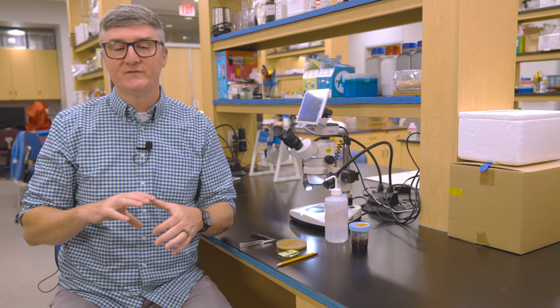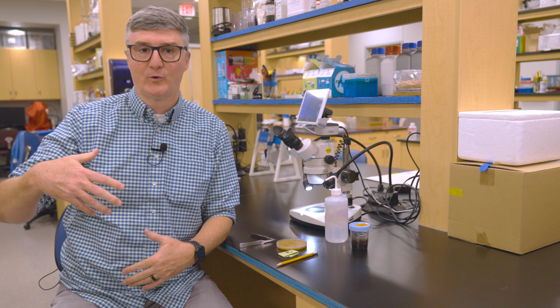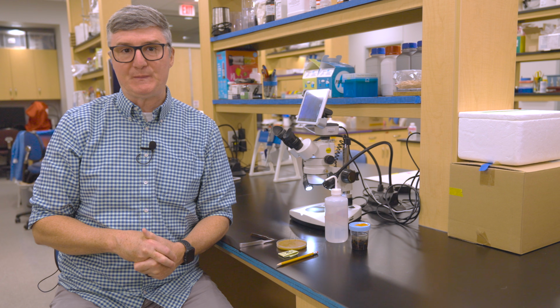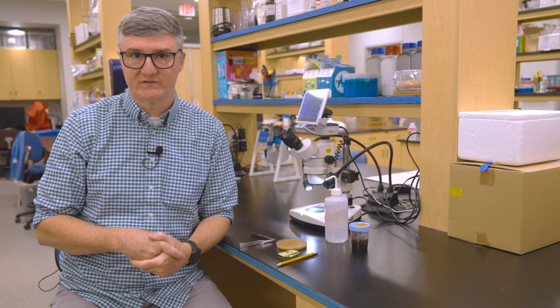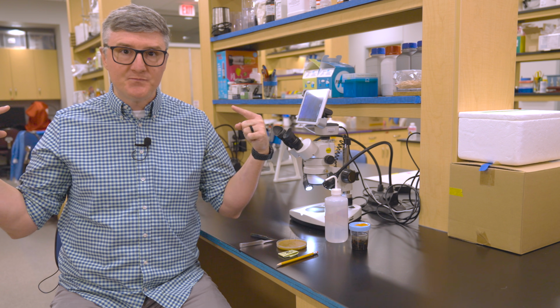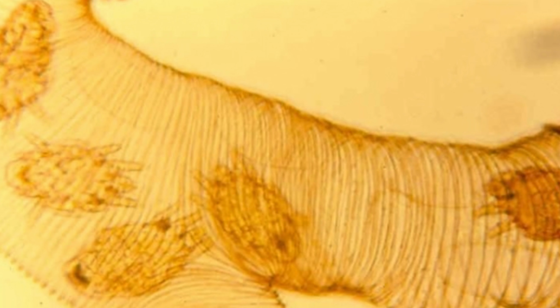The spiracles occur at the base of the forewing, the larger of the 2 wings on the side of the bee's body. The spiracle at the base of the forewings is large and leads to the largest tracheal system in the bee. So the tracheal mites will go through those spiracles and into the trachea of the thorax.